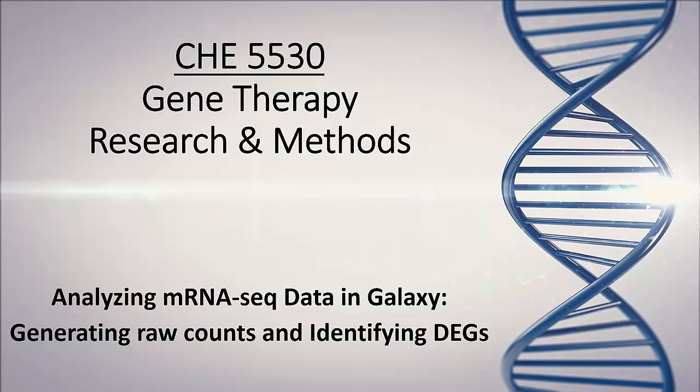Hi everyone. In this video, I'm going to show you how to take raw mRNA sequencing data and process it in Galaxy, an online web server. Specifically, our goals will be to generate some raw counts, so pretty much the number of reads that were detected for each gene in this experiment, and how to identify differentially expressed genes. These would be genes that are significantly upregulated or downregulated between two or more different samples.